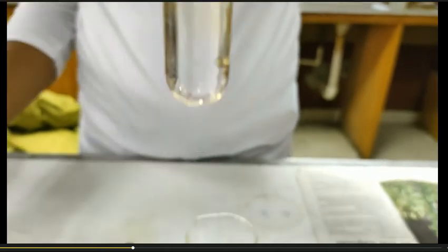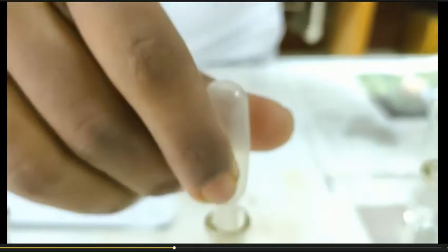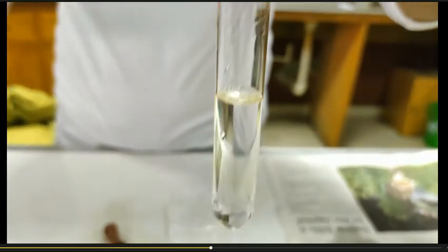It didn't dissolve yet. Now this is a clear solution, which indicates the presence of zinc ion.